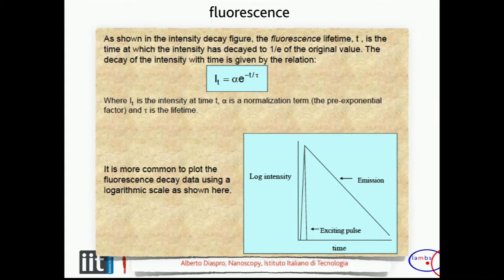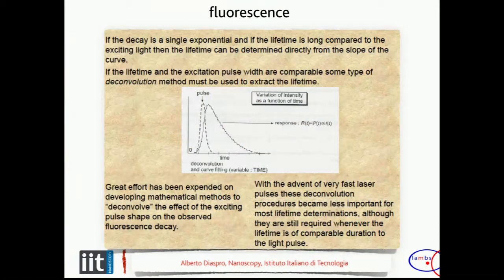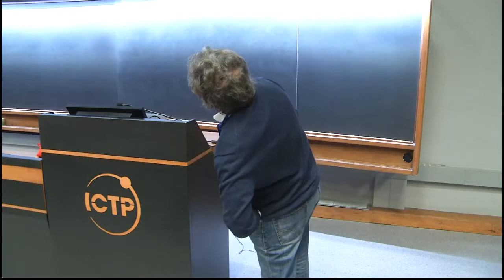In this case, you have the possibility of reporting point by point, or measurement by measurement, the lifetime of your molecule.